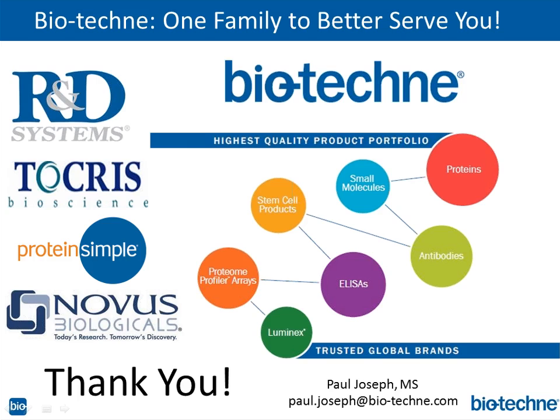Because these kits are fine-tuned, and everything is meant to work together to optimize the signal and noise. Getting these to work is not trivial. It takes years to pick the right antibody pairs and to create the best signal and the lowest noise and the cleanest background. In fact, my colleague Dave Finkel, who coordinated this and worked on a lot of these arrays in-house in our labs, would probably know if we've tried this in-house. But the long and short answer is theoretically yes.